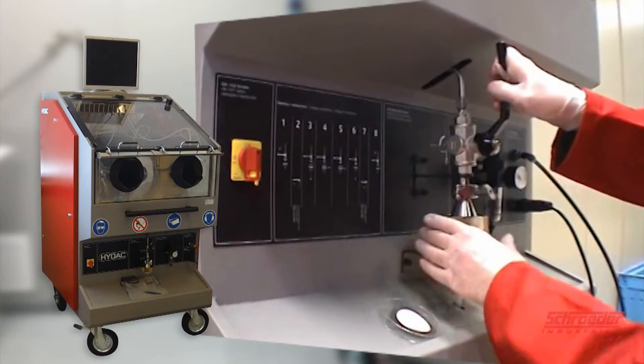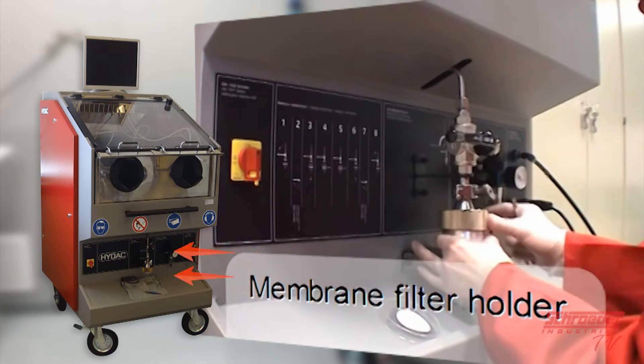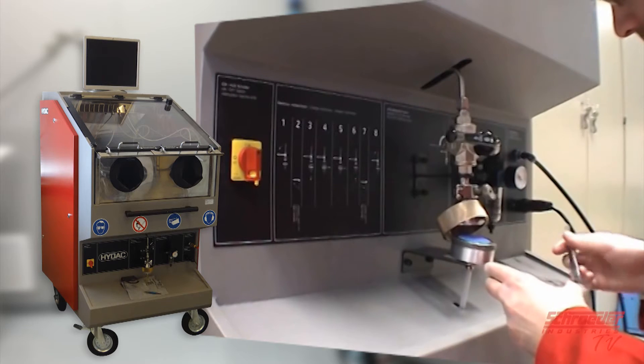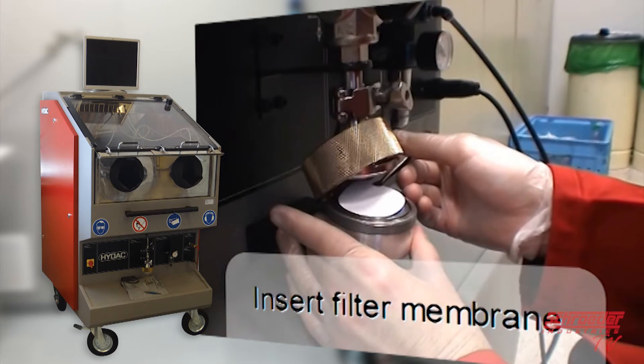Right underneath the clean box is the membrane holder. All fluid from the clean box with the collected contamination passes through this holder. Before inserting the filter membrane, a new clean patch that has been dried in an oven and weighed for base weight will need to be inserted. Patches usually collect 5 or 10 micron particulates.